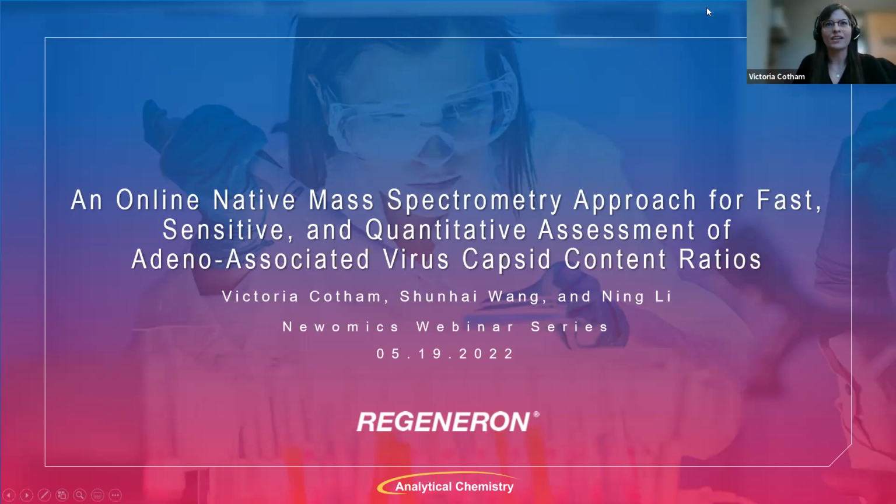All right. So, first, thank you, Tom, for the kind introduction, and also good morning on the West Coast and good afternoon on the East Coast. First, I'd just like to thank the Newomics team for this opportunity to share our work on the development of a fully integrated native mass spectrometry approach for the characterization of intact adeno-associated virus particles. And really our overarching goal for this work is to streamline the native analysis process for AAV product characterization within a biopharmaceutical setting.